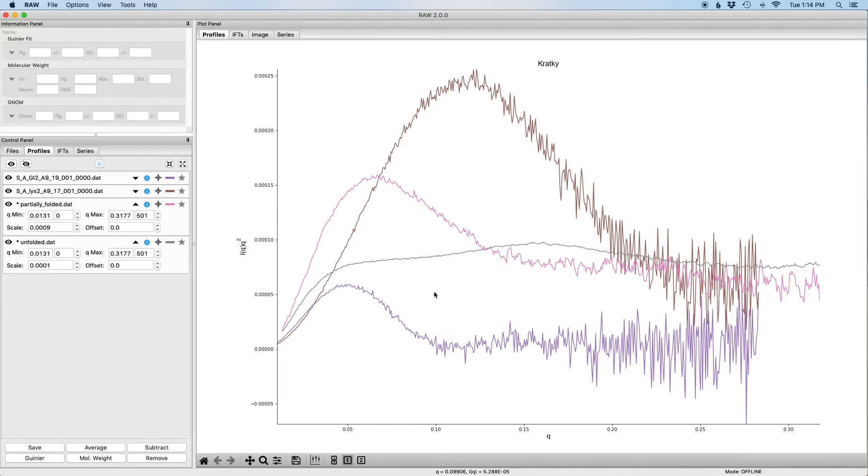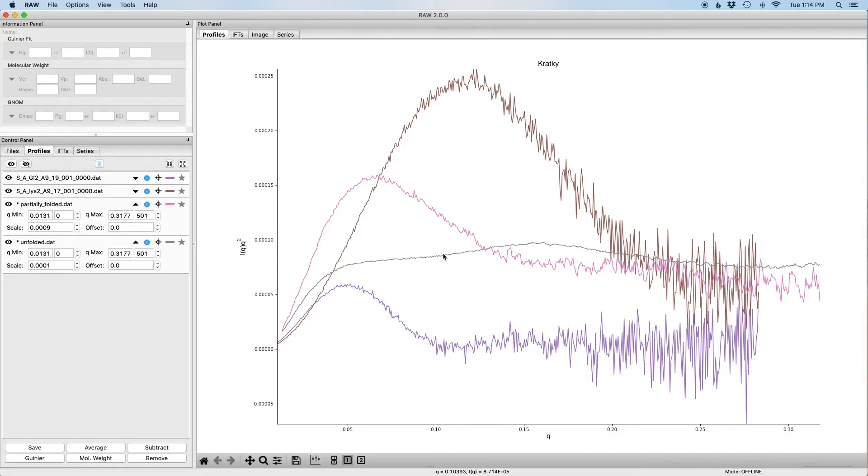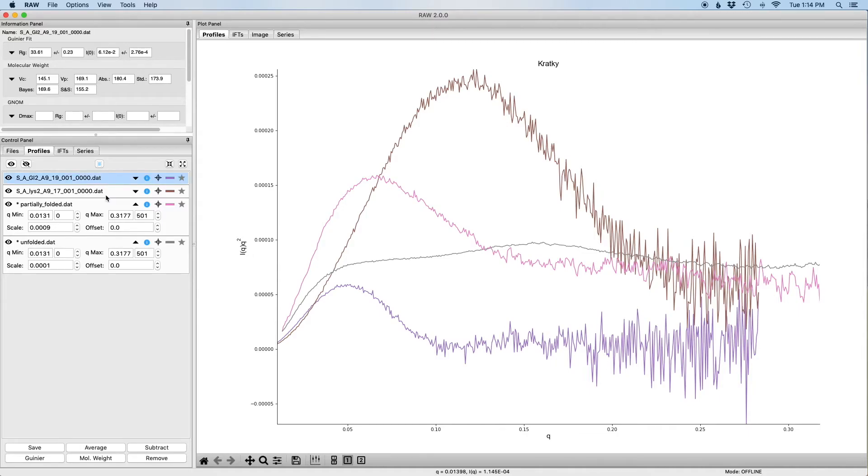So Kratky plots are quite useful. They can give you information about folding and whether you're going to have a folded versus unfolded. But because the presentation of the Kratky plot here depends on the size of the macromolecule, they're not actually that useful for comparing essentially the same shape of different sizes.